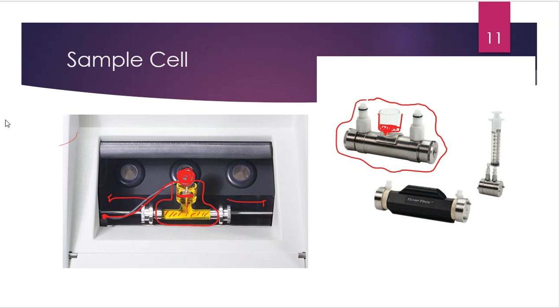But the cup models, we really don't worry about that too much. They are often the easiest for people to use and the simplest and quickest to fill and to dump. Some of the other options, and by the way, glass can break, and we hate if you break our polarimeter cells. Stainless steel is a little bit better because it's going to withstand a little bit of abuse. So you don't really have to worry about dropping it and cracking it so much, but with the glass cells, you do. The problem with the stainless steel, though, is that you can't see through them.